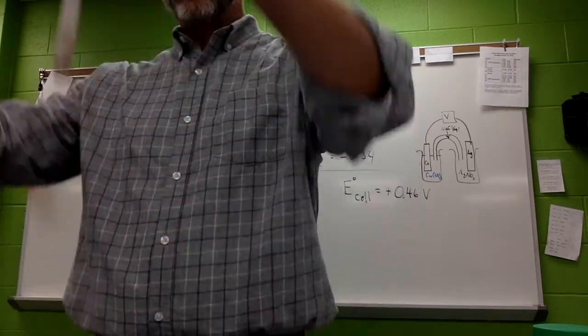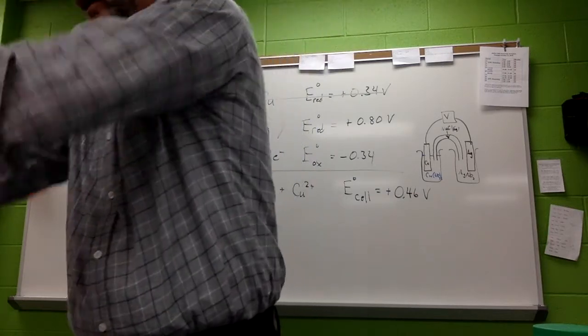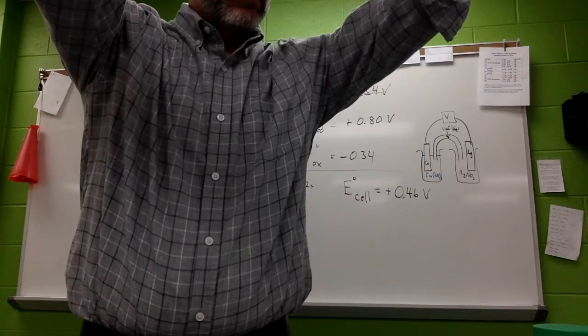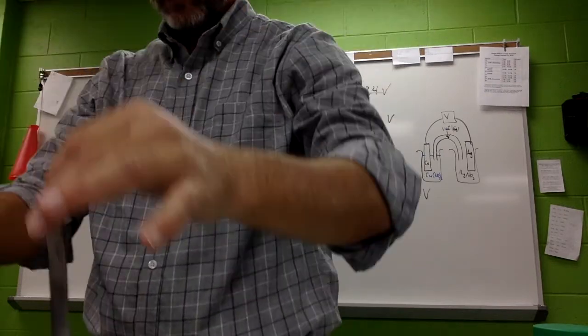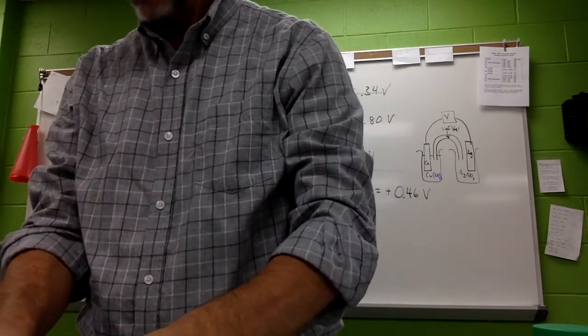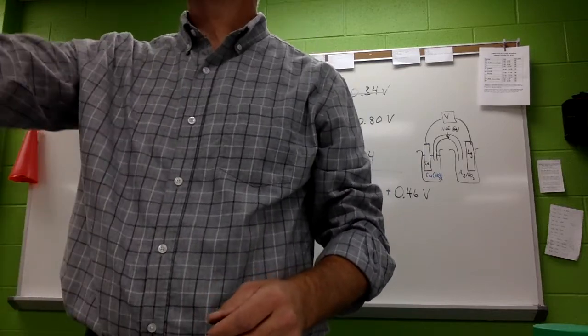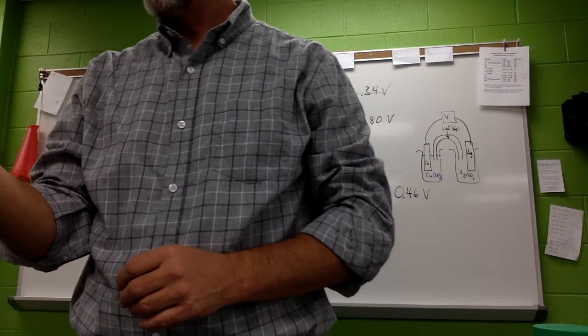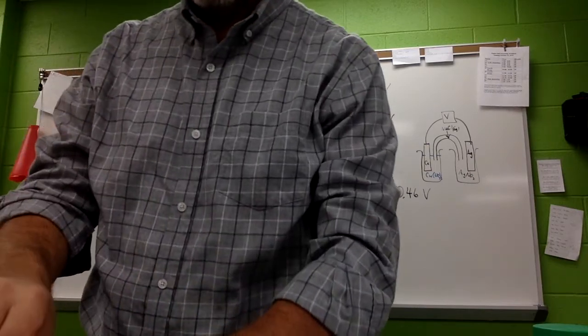Okay. Just for fun, I just want to show you the condition of the electrodes. Copper oxide, is that copper? And we have a salt bridge, which may or may not work.